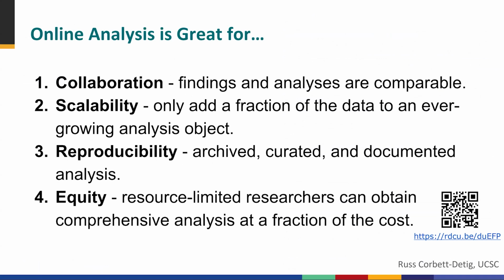So wrapping up, we've found that this approach of maintaining a big daily updated tree and making it as accessible as possible has scaled with the volumes of data. It's been somewhat useful. And it's been important to us also to make it so that anybody with internet access and a SARS-CoV-2 genome can use our resource to get placement in this 16 million sequence tree for their sequence.